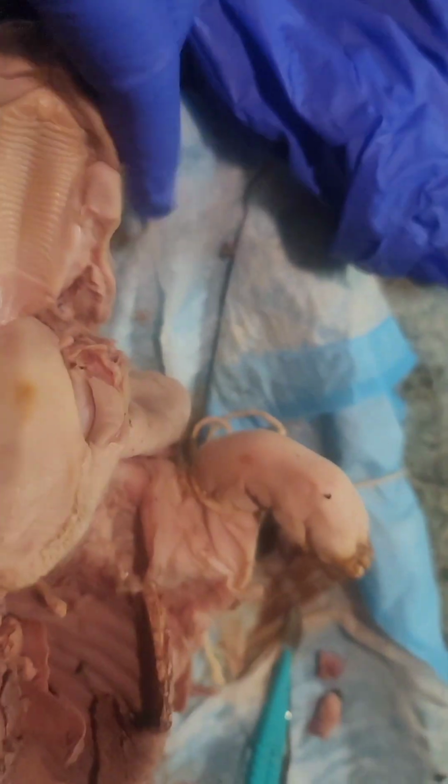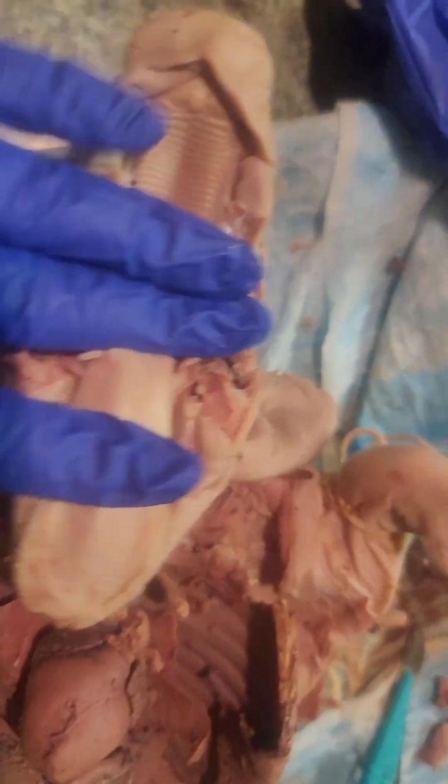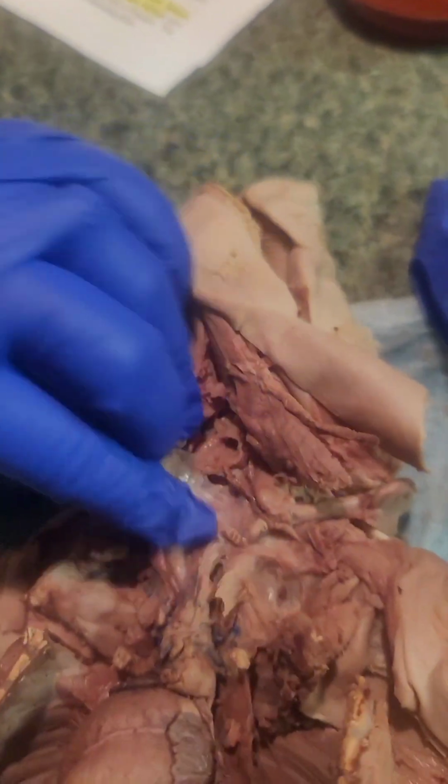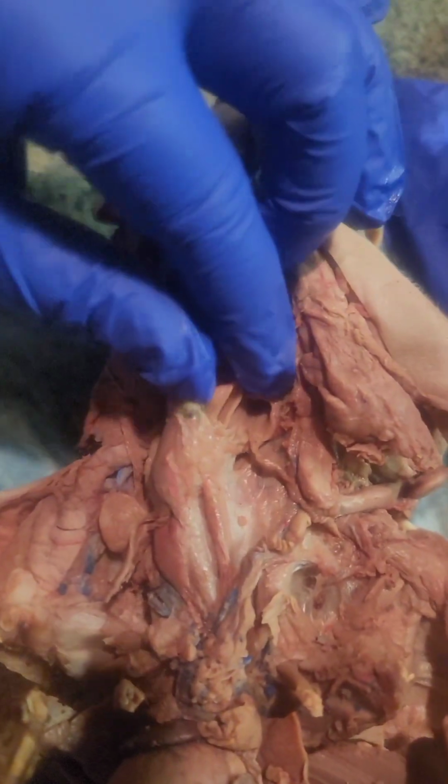And then you can see the epiglottis, maybe. There it is. It is poked out. Right there. The epiglottis. And then we go down to the esophagus, which I had cut apart by accident.